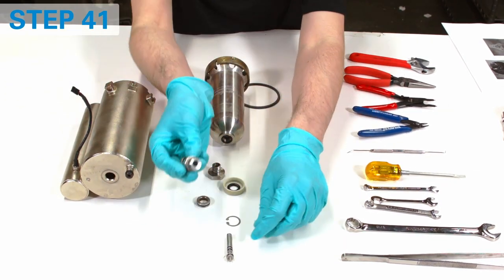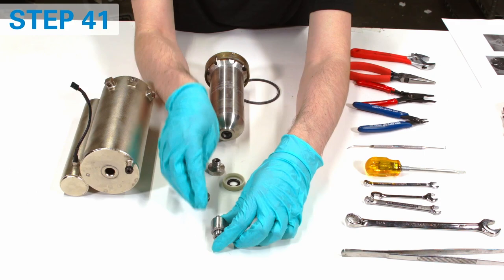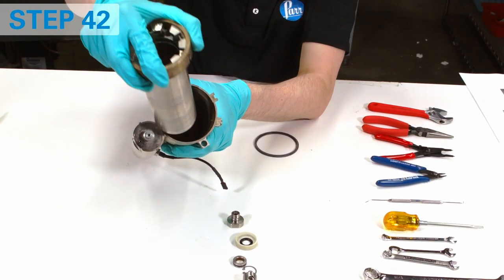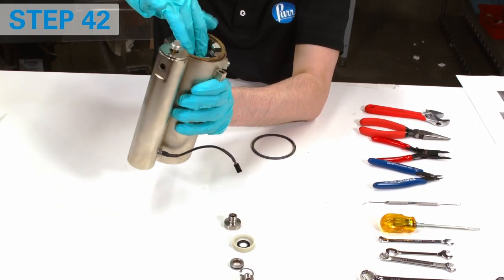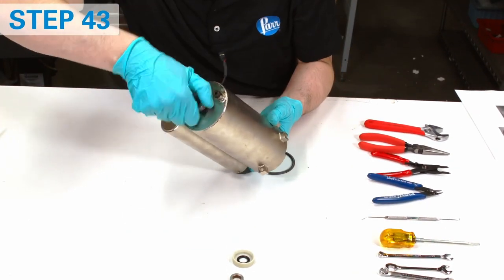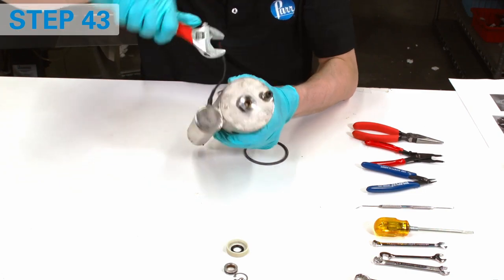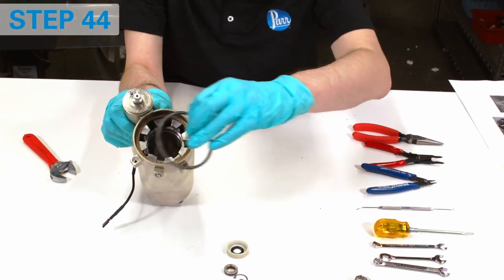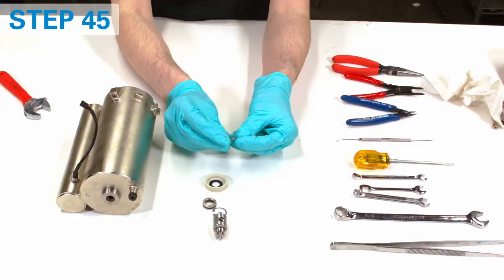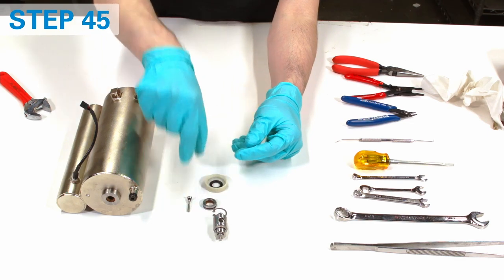Now it's time to reassemble the bucket. Make sure that the o-ring is sitting in the vessel's groove. Match the vessel orientation with the pin on the wall and make sure that the brass ring is fully seated — otherwise you will have issues while closing the head. Reinstall and tighten the screw. Place back the o-ring. Do not forget to change the o-ring on the bottom check valve as well. The bucket is now ready.